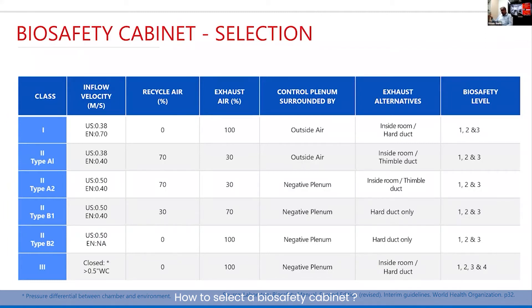For Type A1, the clean zone is surrounded by outside air and therefore the risk of contamination remains — 70 percent of the air gets recycled and 30 percent gets exhausted. Class 2 Type A1 is not generally used nowadays in any of the facilities.